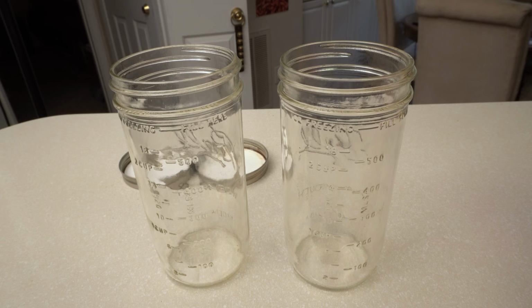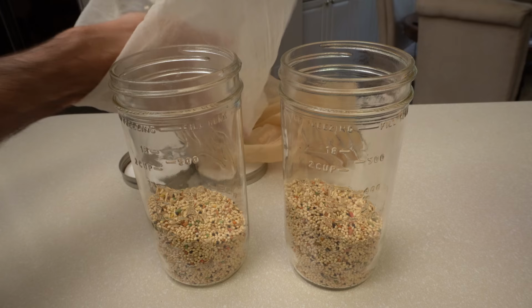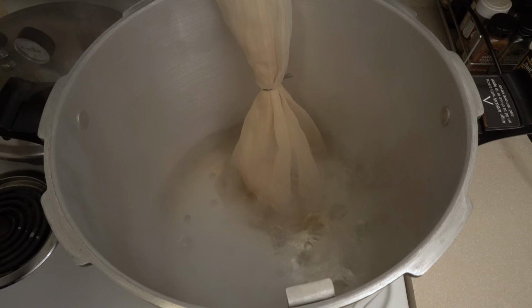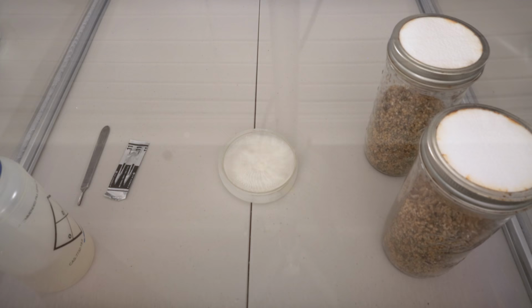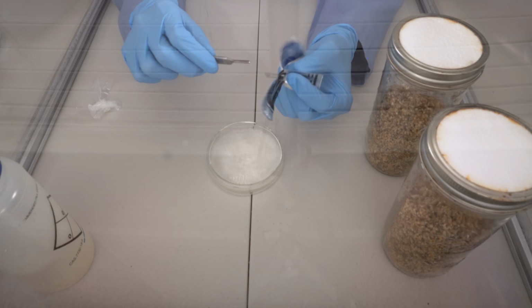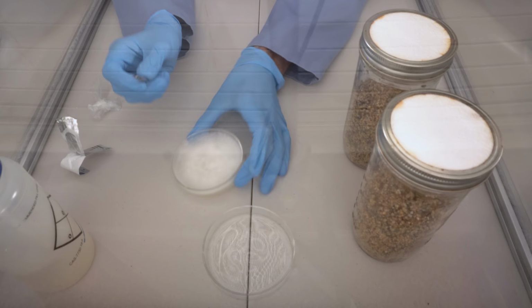Next, we'll create spawn substrate to grow up some mushroom biomass. I'm using bird seed here, which will need to be hydrated and then sterilized in a pressure cooker. A small excision of the mycelial lawn is used to inoculate our spawn substrate, then it's allowed to incubate for a few days.